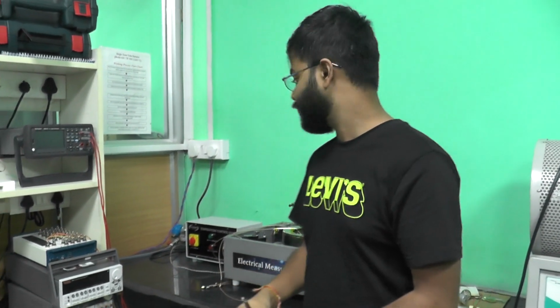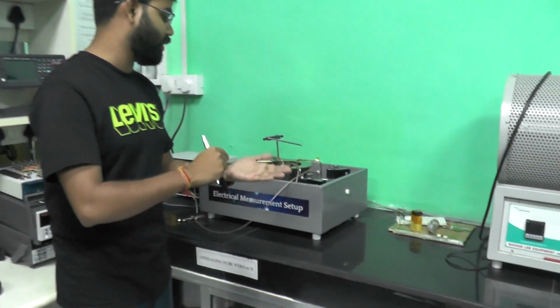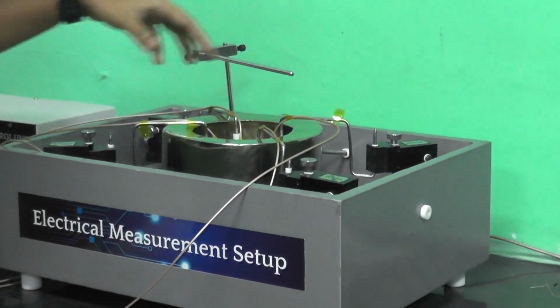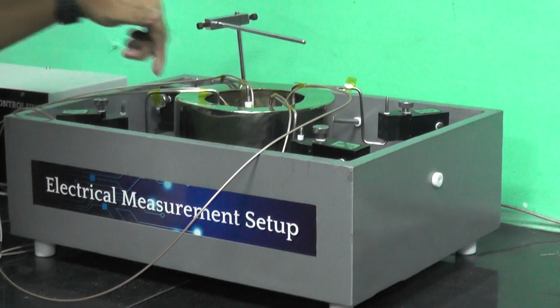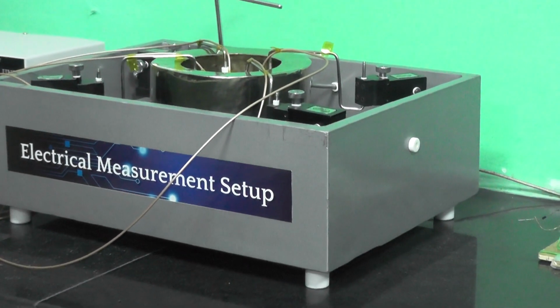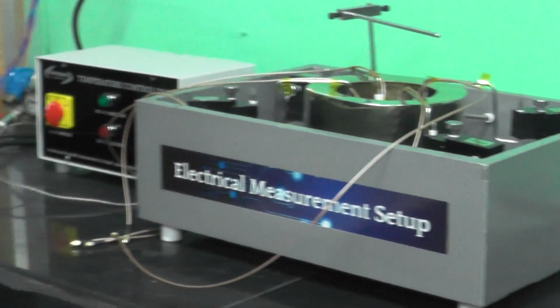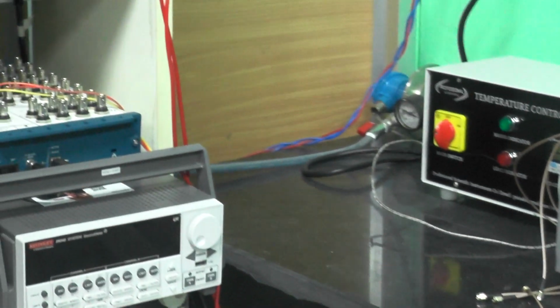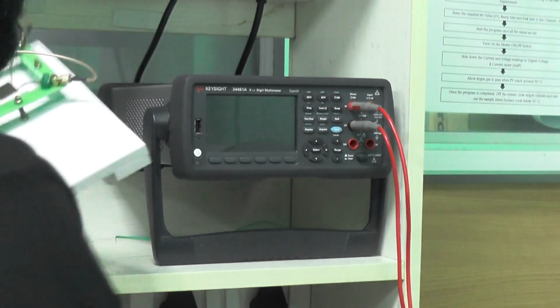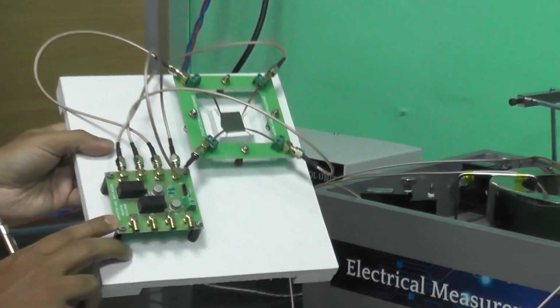So we put our thin film sheet into this probe station, and this is a 4 probe measurement system. There are 4 probes, and we are connecting all 4 probes to our machines. 2 probes are connected to the SMU, and the other 2 probes are connected to the DMM, and in between we are using our custom designed PCB.